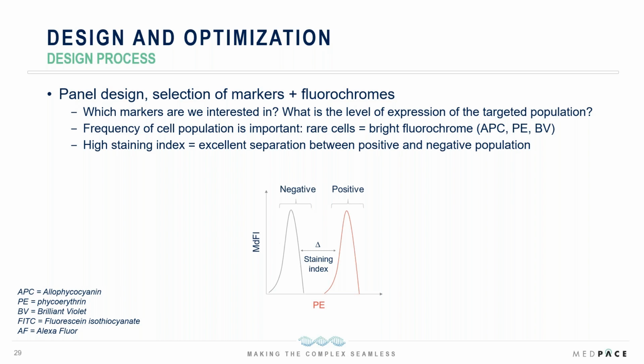So you really need to know that the cellular population selection is really important. The receptor occupancy measurements at a given concentration of drug can be cell population dependent. For example, a higher expression level may result in a more robust assay. So this is really important to check before.